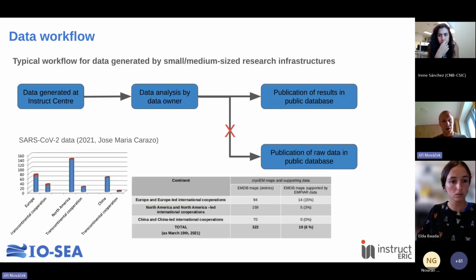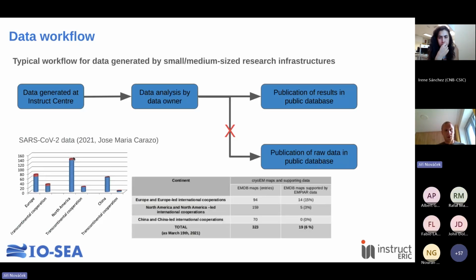Similarly, and then I will now show you the data that was shown to me 3 years ago by Jose Maria Carrazzo. Similarly, during the SARS-CoV pandemics, the EM community has produced large number of structures, but only for very few of them the original data were published together with the structural data itself.